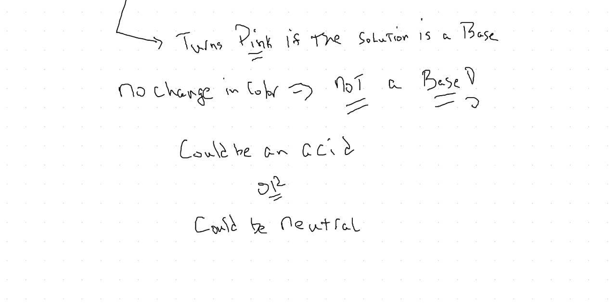So we're going to use the downward displacement of water, collect oxygen in a jar, and then mix in metals and non-metals and use our indicators to see if this really holds, if we get acids or bases, whether you have a metallic oxide mixed in water or a non-metallic oxide mixed in water. For more details, you can go to the lab videos on YouTube with Professor Gorbenko.